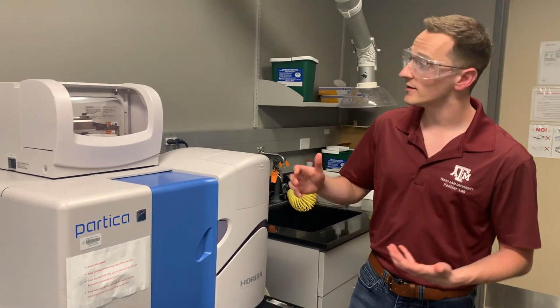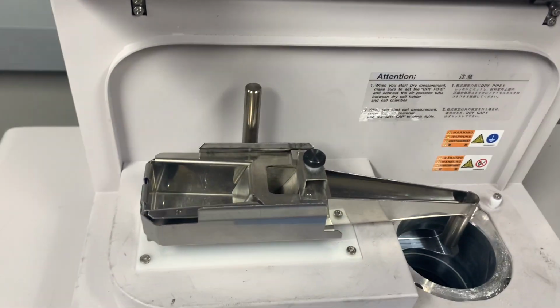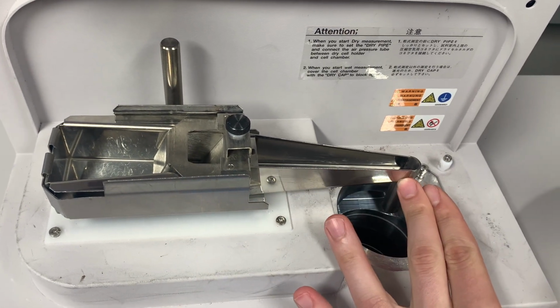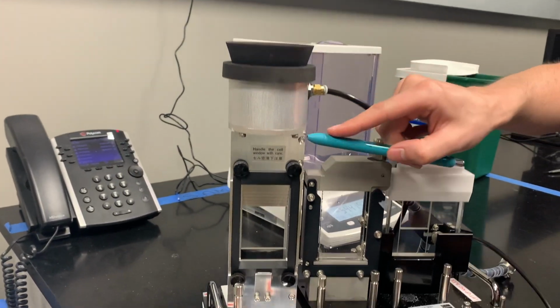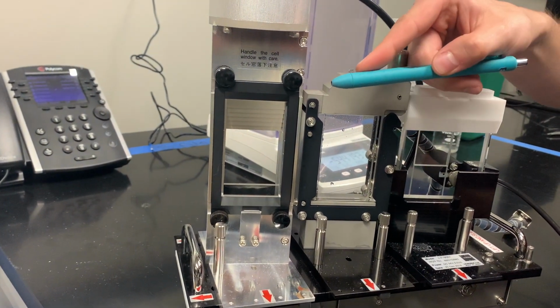There are three general methods for measuring particle size analysis using this instrument. The first is the dry cell method, in which a dry sample, about a tablespoon, is placed into this top trough here, and then the sample falls into the instrument through this long, narrow trough. From the trough, the sample falls through this cylinder and then down into this window through the path of the laser, at which point a measurement can be collected.